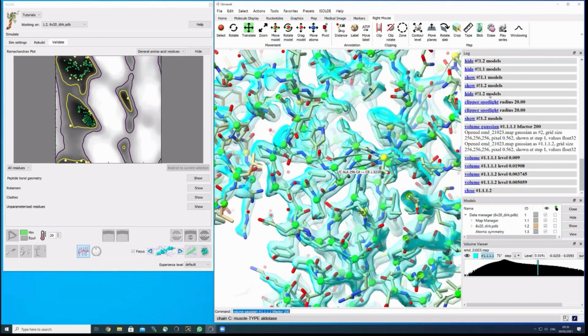So this is where all this is basically originating from: very experienced model building experts have used 8,000 high resolution crystal structures in the 1 Angstrom realm, and have modeled them and used that information to define what these angles can look like for certain residues in these high resolution structures.